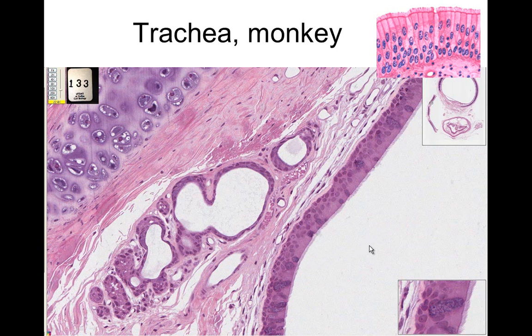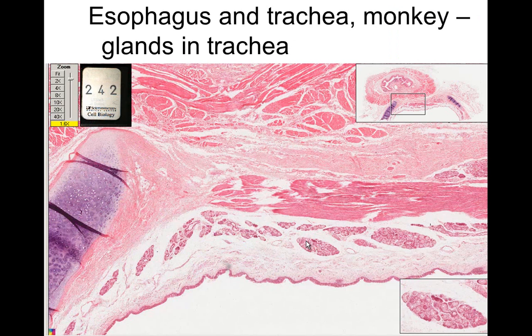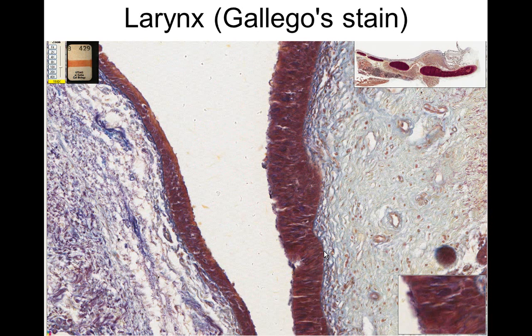So this is the airway of the trachea, cartilage over through here, and we can see other nuclei in those fibroblasts in here, but this is epithelial cells that line this space. Again, we can see those epithelial cells in the trachea right in through there, and also we see glands, glands themselves which put moisture in the airway, those too are epithelial secretory cells.